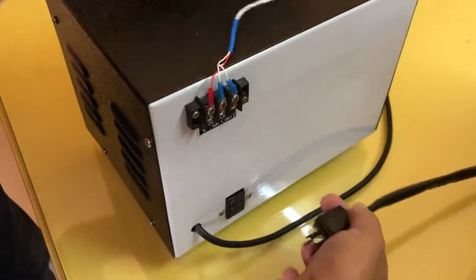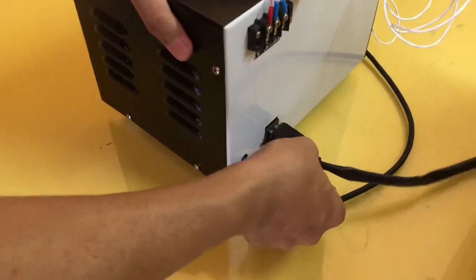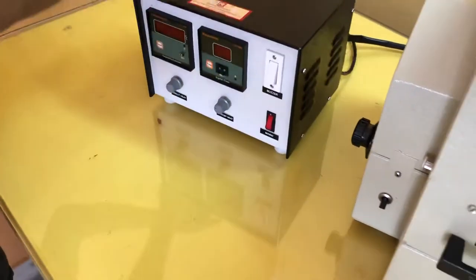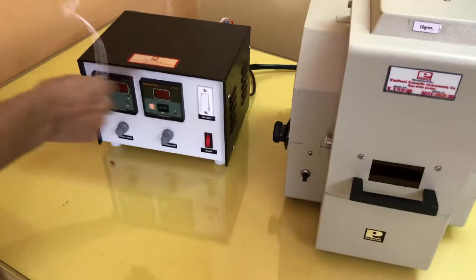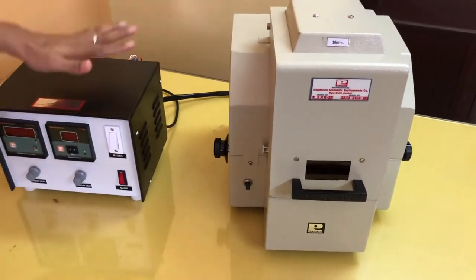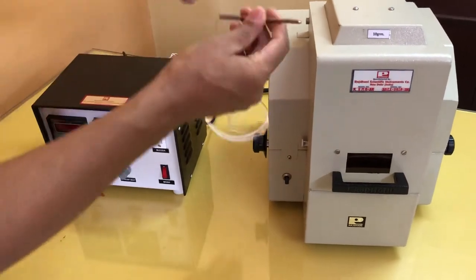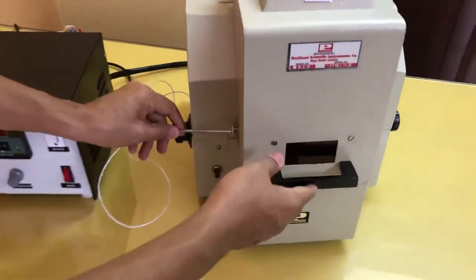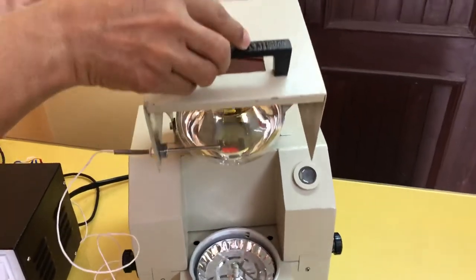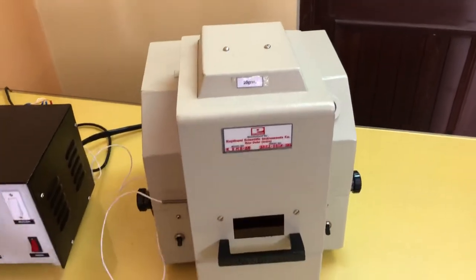Here we just connect it. It can be connected in one way only. So in installation, connect this main unit's six-pin connector to the control unit. And then insert this sensor — here is the port given for this sensor. We just insert it. That's it. This is all the installation part.